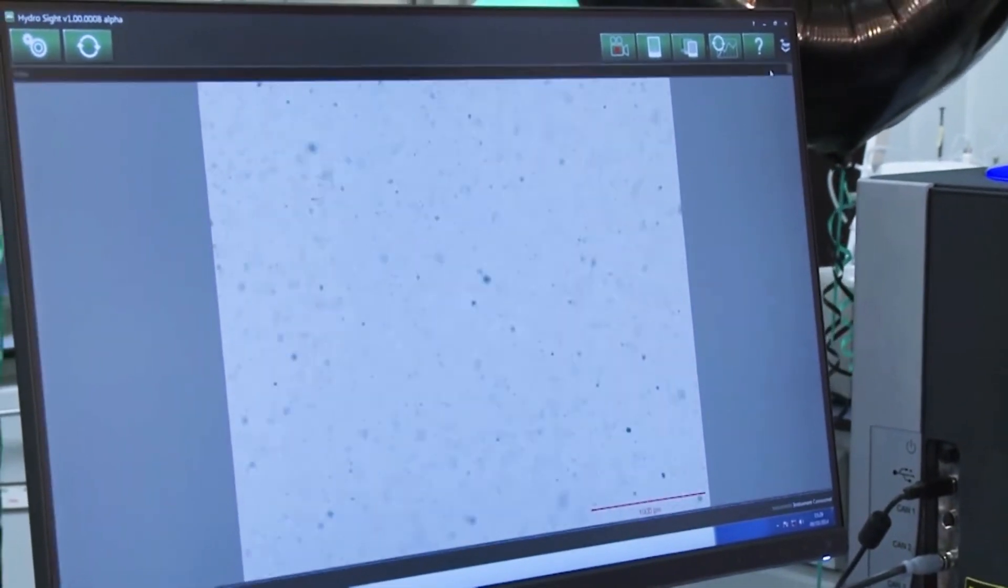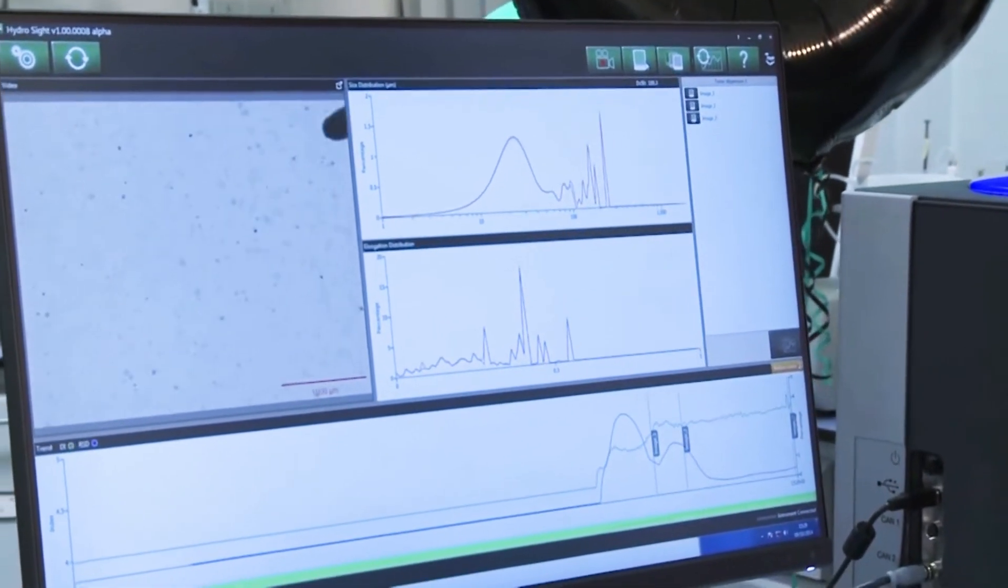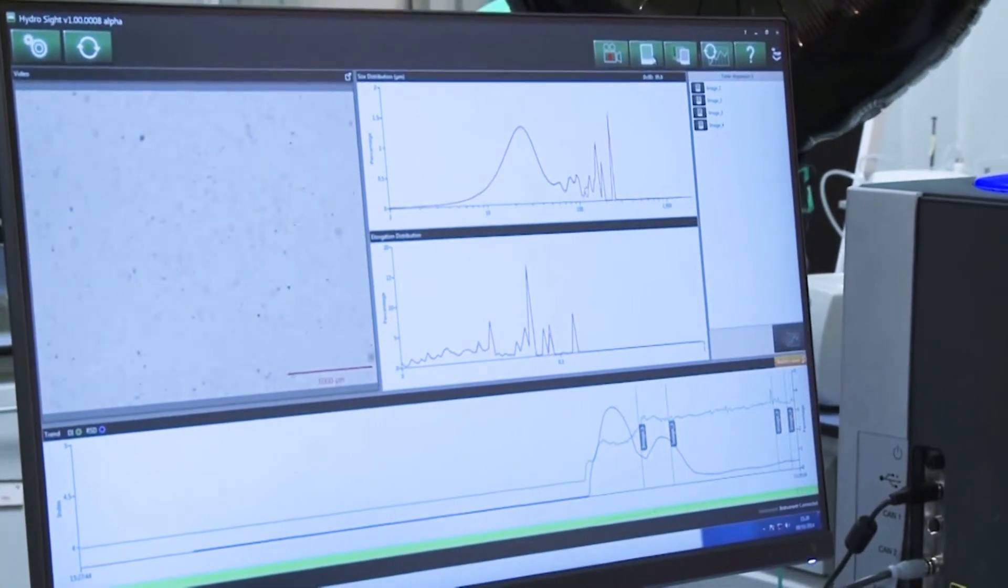If I just return back to the main view, I'm going to grab an image or two of those so we've got something to show later. Are you ready to try the dispersion?